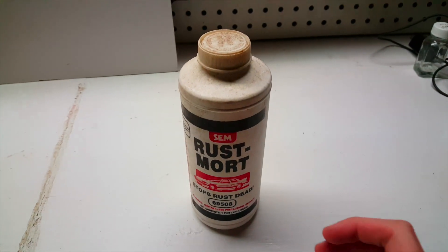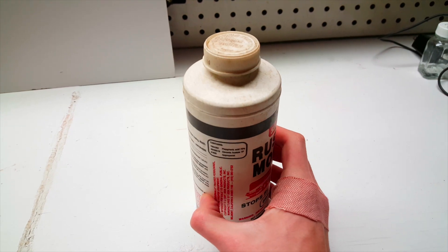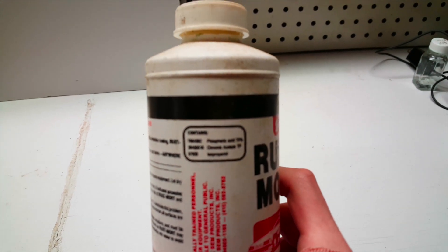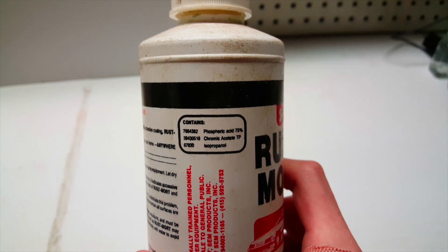Today, I'll be extracting relatively pure phosphoric acid from this incredibly old rust remover product that I found. According to the bottle, this rust remover contains about 75% phosphoric acid, which theoretically means I should get a pretty good yield.